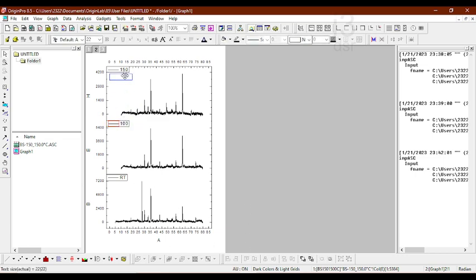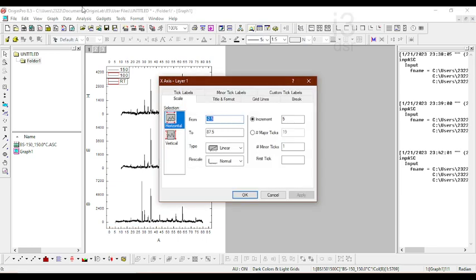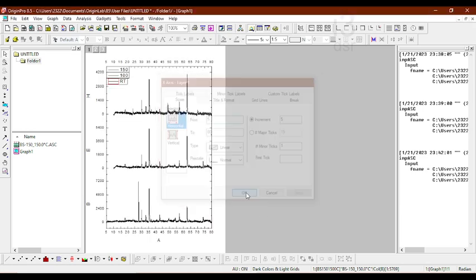So instead of having legends here, I'm going to create them here, here, here. So now this looks different. I'm going to adjust the scale to 5 and 80. Why 5 and 80 is because if you observe the scales below, you could see that the 5 is here and 80 is here. So I do not want any gaps in between. So I'm adjusting this, click OK, apply. Now it is filled.